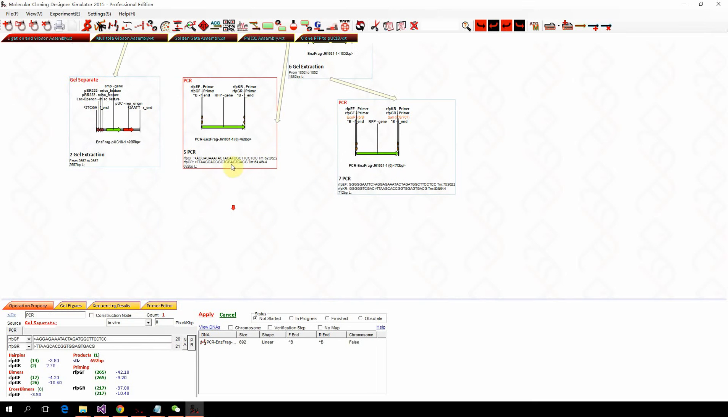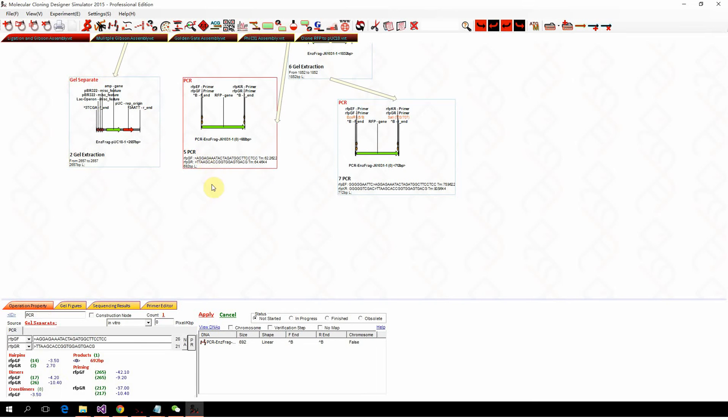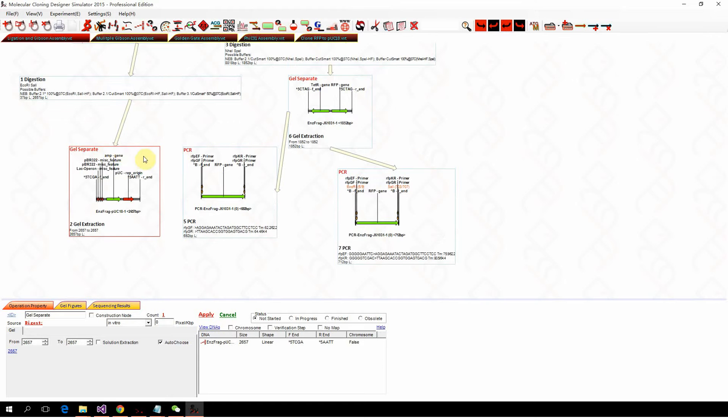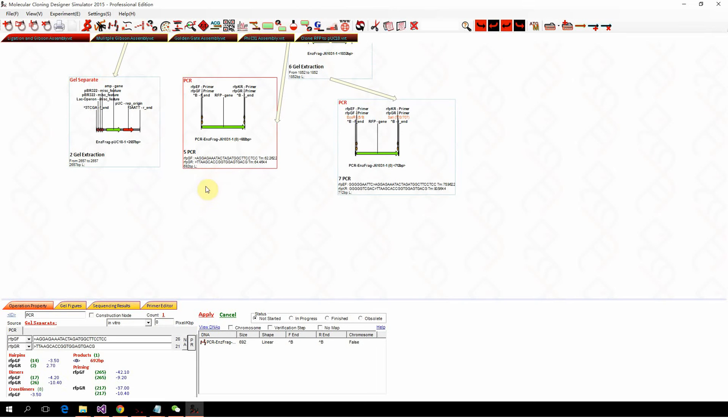To perform Gibson assembly design, we need at least one PCR node, and the other fragment can be gel purification or whatever. As long as the Gibson assembly design can modify the PCR, it would work.